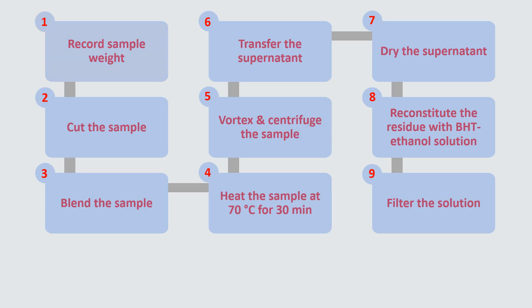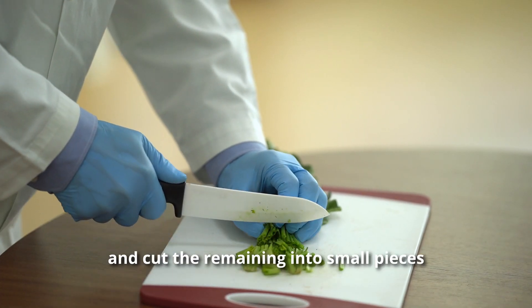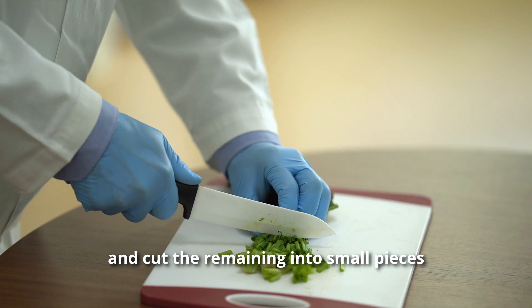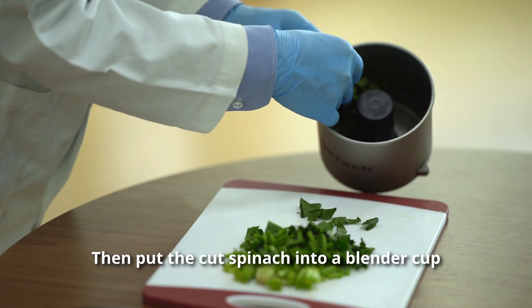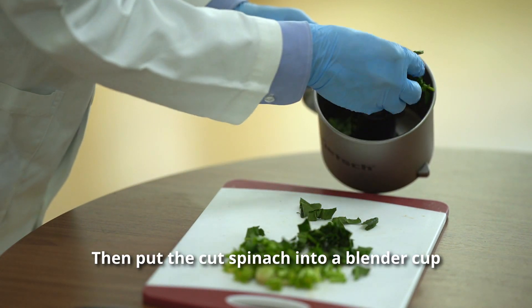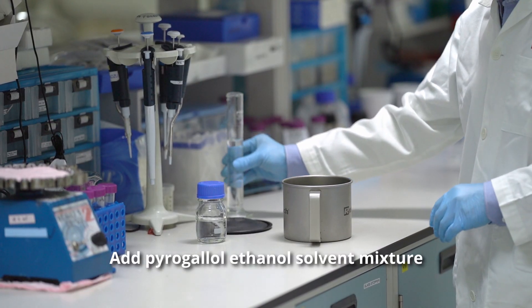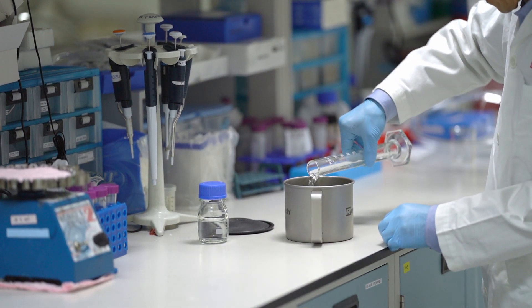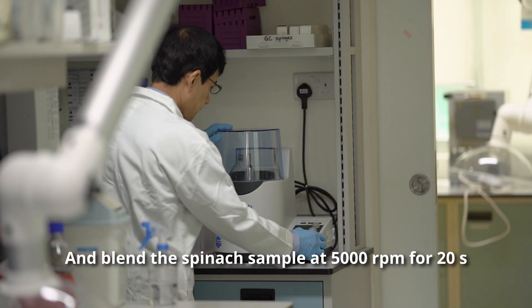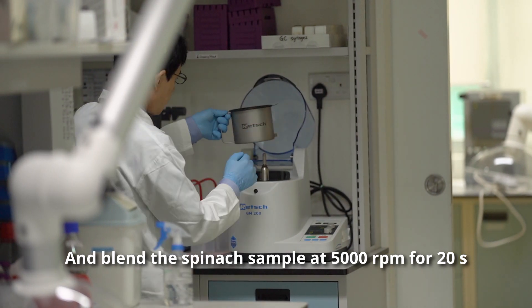Let's start the sample preparation. Measure the weight of each sample. Cut off the root of the spinach and cut the remaining into small pieces. Then put the cut spinach into a blender cup. Add the solvent mixture into the same blender cup and blend the spinach sample at 5000 rpm for 20 seconds.